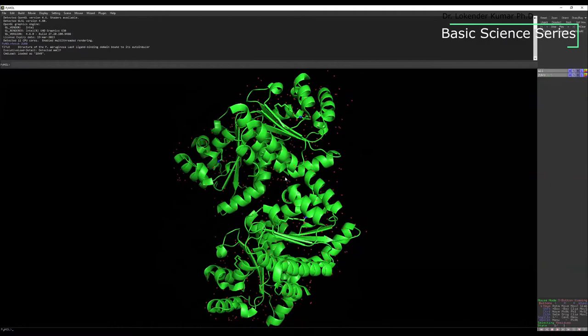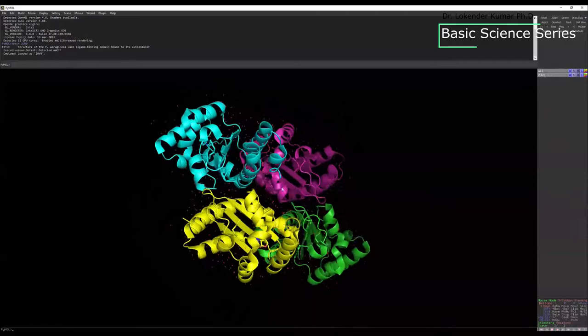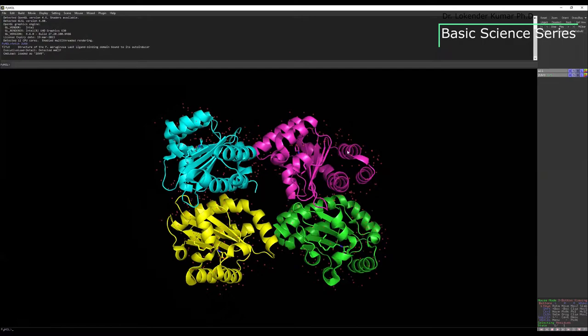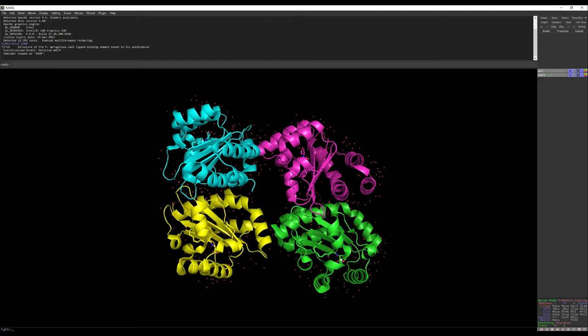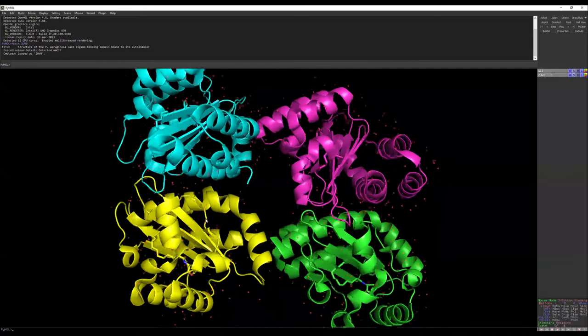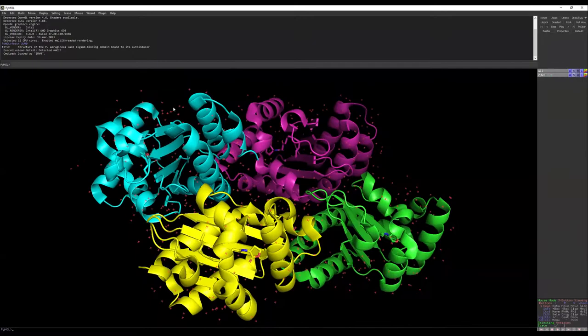As you can see here, you have four chains. Let me show you by changing the color — go to color and then by chain, and you can color all the chains. You can see there are four chains and they are identical. Basically it's a tetrameric molecule. I'm going to delete three chains and process only one single chain, and then I'll show you where the ligand molecule is bound. You can see there is a ligand molecule bound very close to the center of the protein molecule.